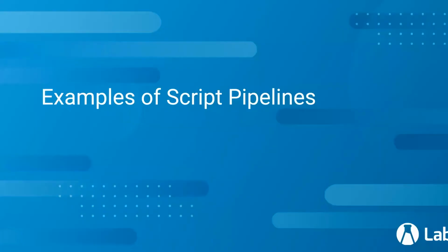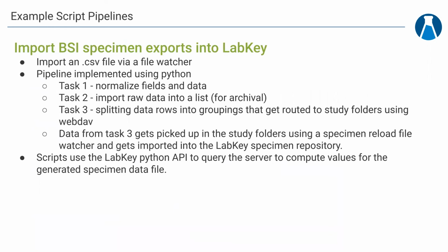All right, so some quick example use cases that we've run into. We had a specimen export, some inventory data provided via CSV. This was picked up by our file watcher, which executed our Python pipeline that uses some Python tasks.